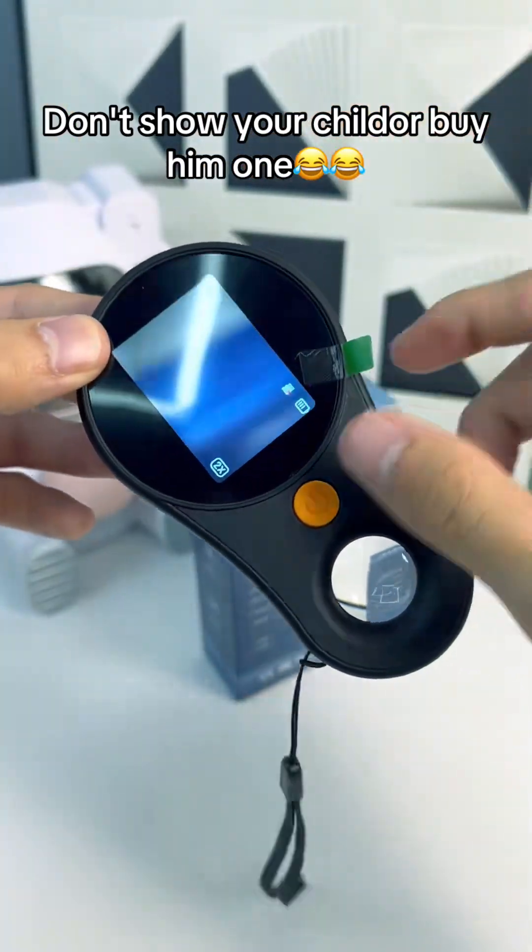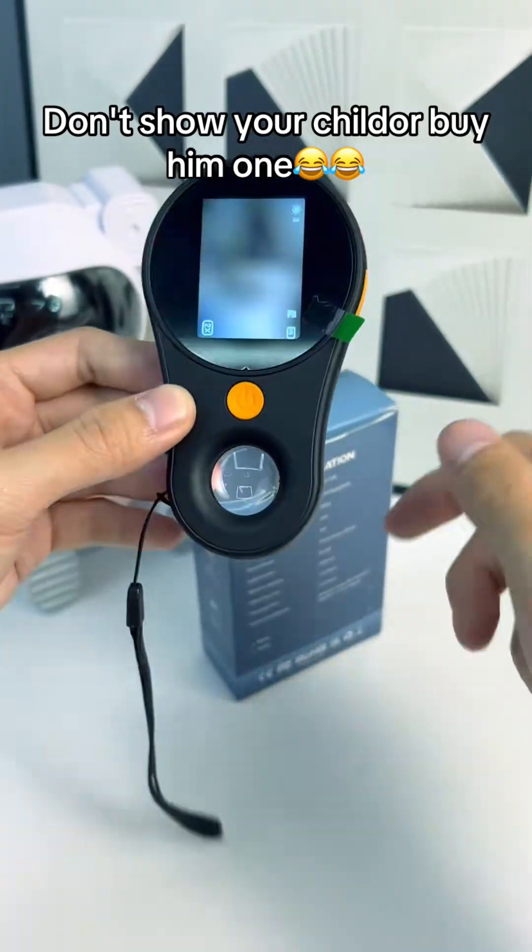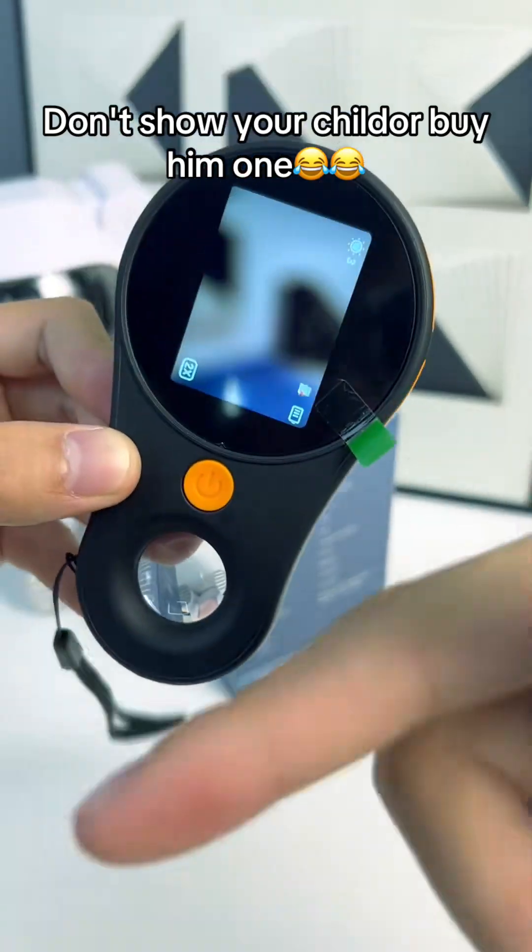These are pretty cool. If you want one, get it for Christmas, get it for gifts. These are absolutely awesome — they're rechargeable. Click on it, hit the shopping cart, guys, and get you one of these.